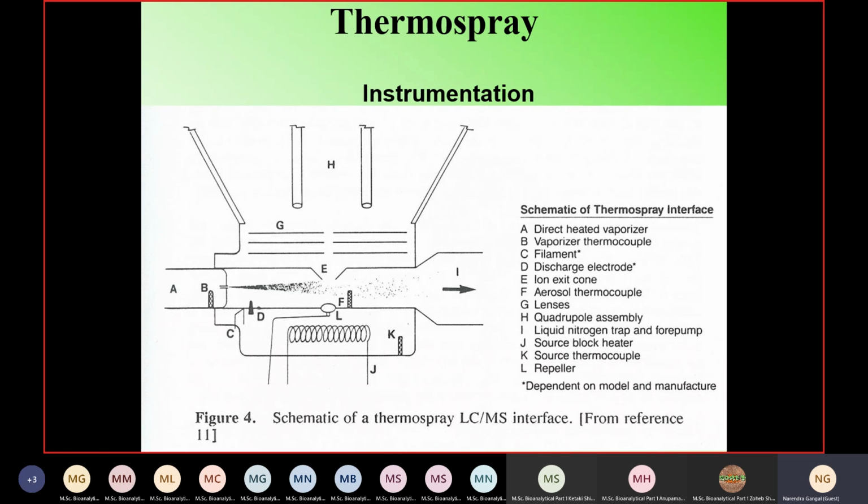But as I said last time, the oil diffusion pump also produces some interfering species because of the oil, so it is not used much, whereas the turbomolecular pump is the most popular. So today I will say the pumping system will have a turbomolecular pump and the rotary pump. These solvent molecules are attracted by the pumping. There is no charge on the solvent molecules, so they go to the pump portion and are thrown out.